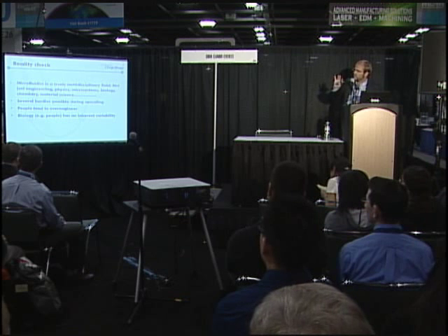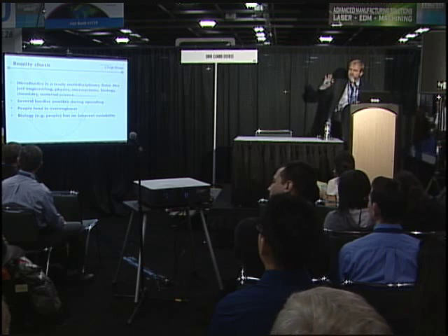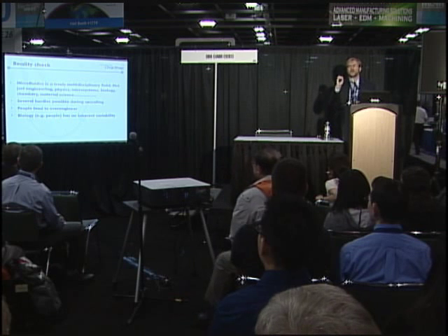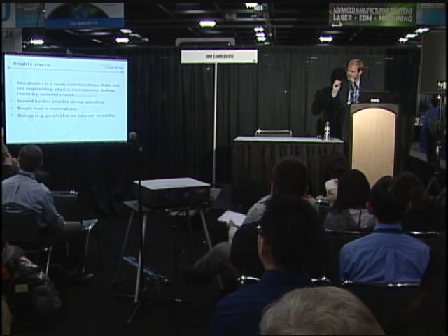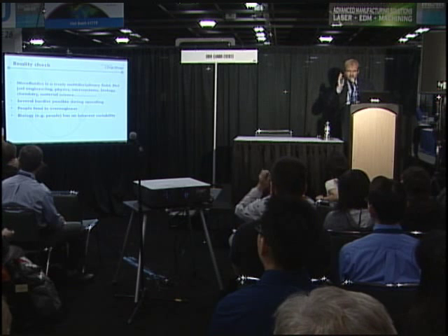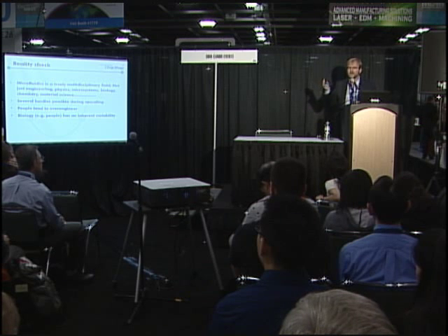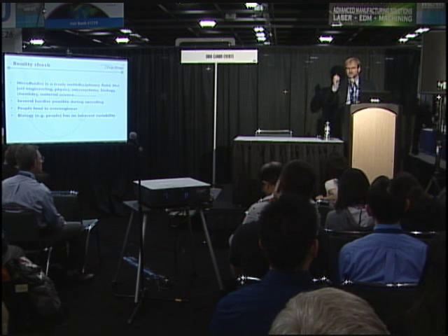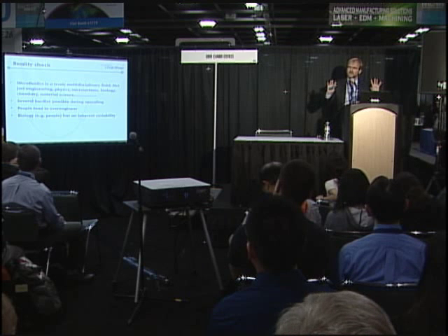Several hurdles are possible, and you have to overcome them during particular upscaling, so from development through prototyping phase to volume production. And one of the things I'm always urging people is, because Microfluidics has a lot to do with materials and surfaces, to try and use scalable technologies right from the beginning, right from day one. And in this case, because we're talking about polymer as a substrate material for disposables, we really recommend use injection molding with standardized formats right from the beginning.